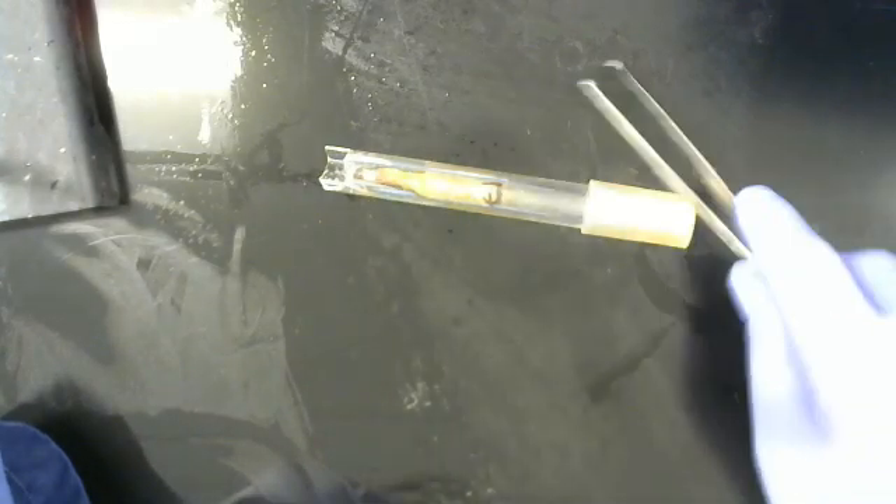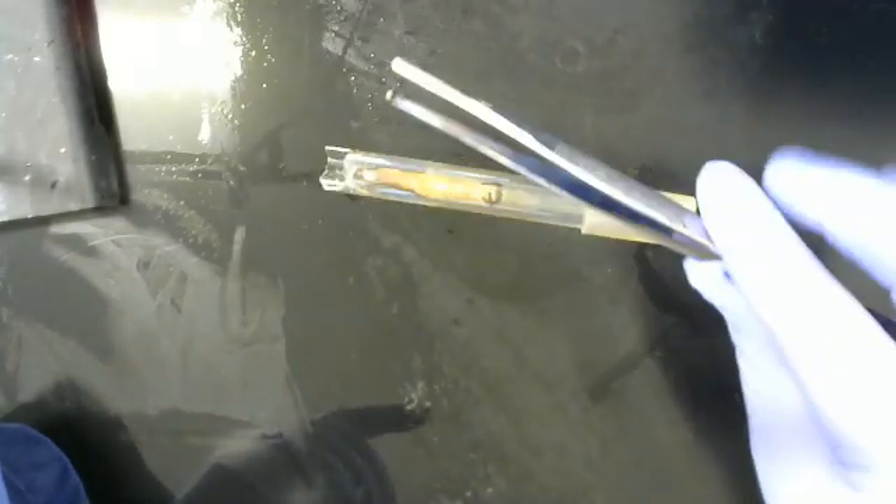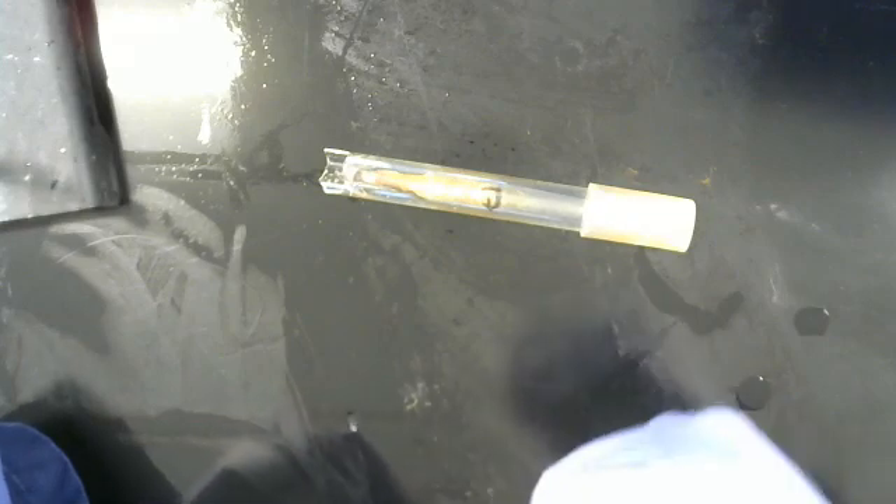Whenever you're dealing with broken glass, you never want to use a gloved hand or a hand at all. You want to use — I'm going to be using a pair of tweezers today because this is a small piece of glass — or a pair of tongs.